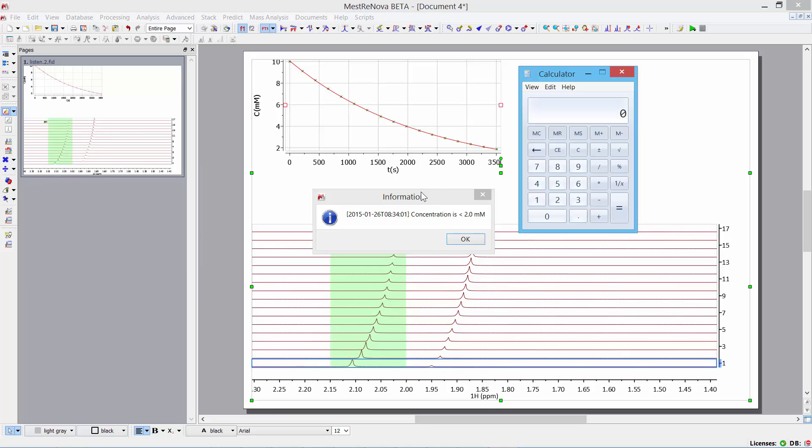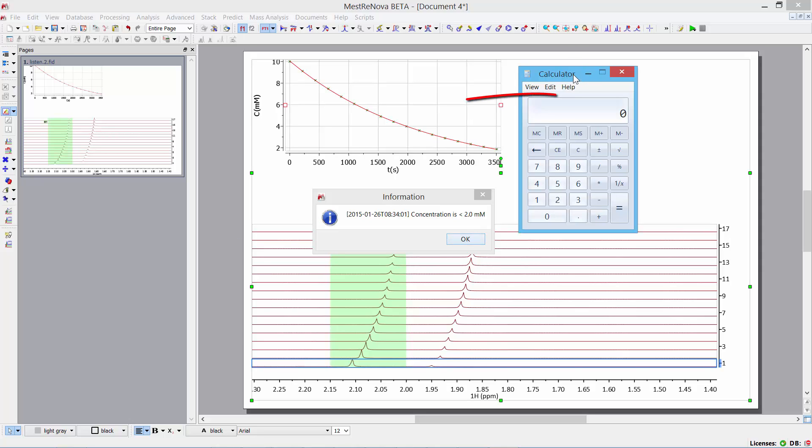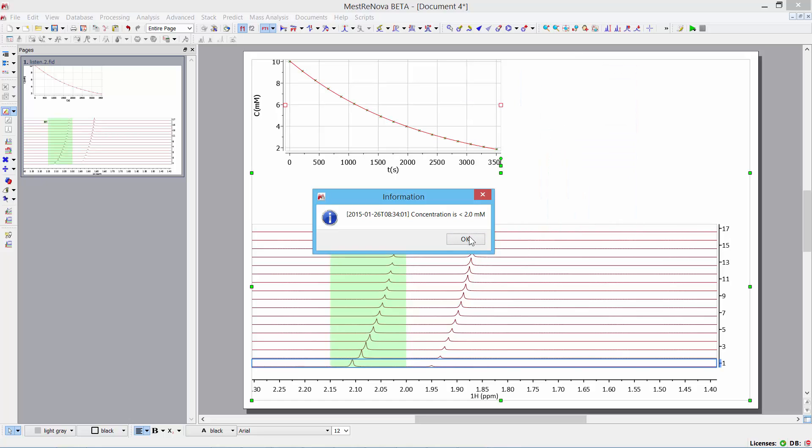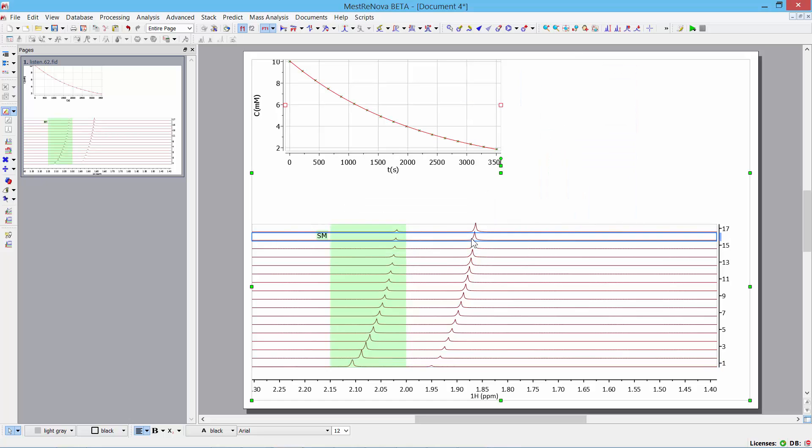Okay. So, here we go. We've reached the condition where the concentration is less than 2. An information window has been thrown up. And this is a little message that I specified. I'm happy with that. And it started the calculator as I asked it to do. So, it's done everything and it's shut down the listener project.